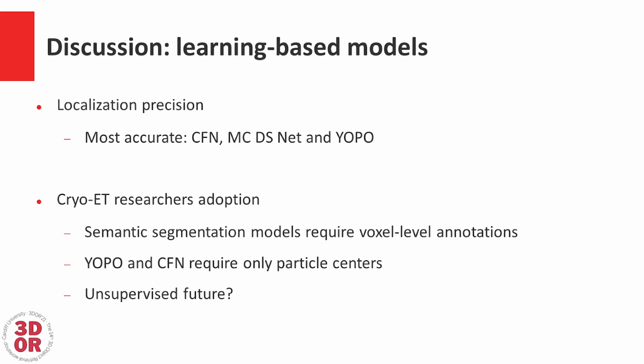YOPO and CFN, on the other hand, require only particle centers, which is very compatible with the current particle picking workflows that practitioners employ. We believe that gives them an edge in adoption. And all of the mentioned methods are supervised, even though, of course, everyone would prefer unsupervised methods. Some work has been done in that direction. For example, YOPO authors recently proposed a new method called DISCA, and it shows very promising results.